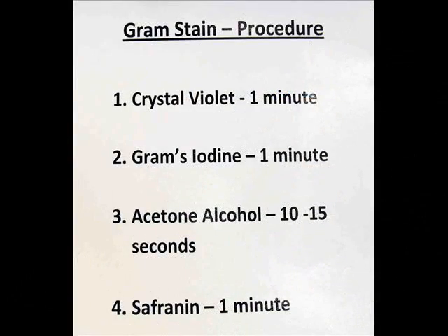Here's my Gram stain procedure. My first step will be to apply Crystal Violet to the slide. That's my primary stain. It's purple. I leave that on for one minute and then I rinse.